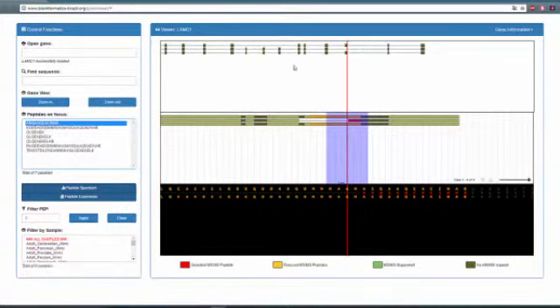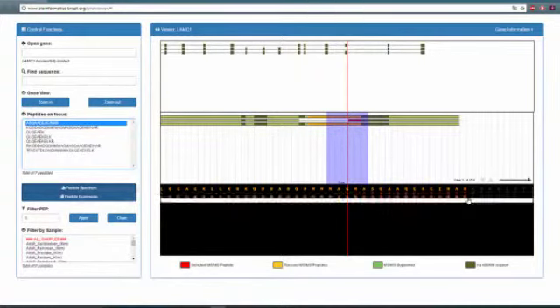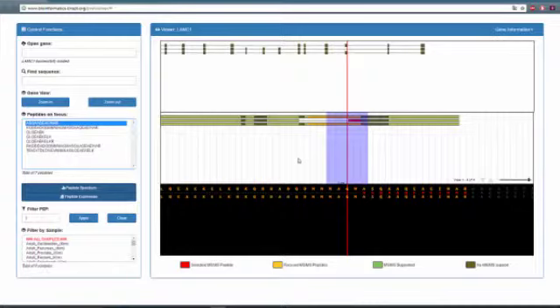You can mouse over, and it is going to show you the name, but of course for the video it's not going to show properly. We can select the peptide, which is going to be highlighted in the primary structure and the sequence of the protein. In this case, this peptide shows an exon skipping of this exon here, because you have the alignment with the genomic information. And with a couple of clicks, you can see the quality of the identification.